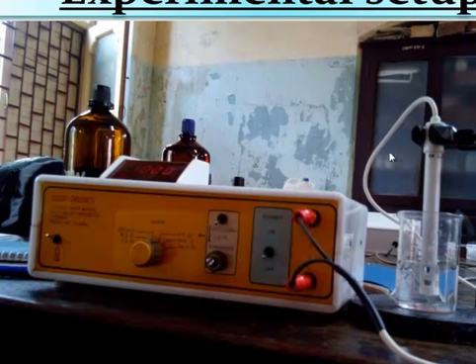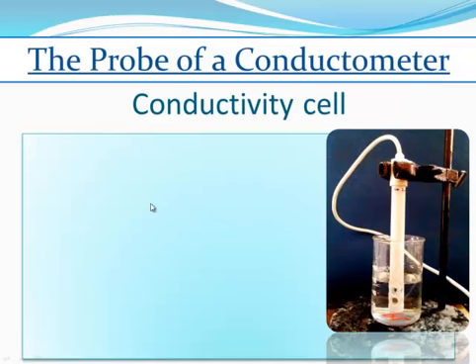In that case, the probe and its solution will be brought into the circuit and the display will show the reading of the conductance of the solution in millimhos or millisiemens. Similar diagram out here. Now, what is the probe of a conductometer?